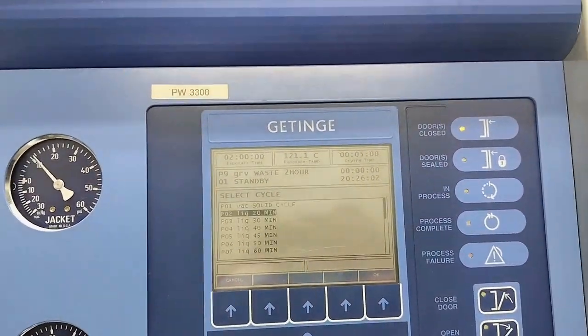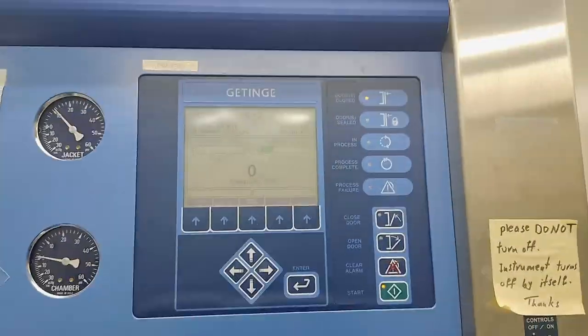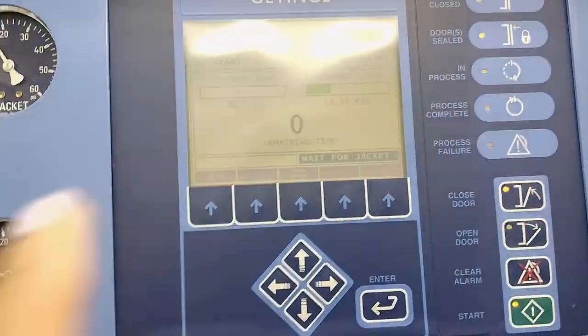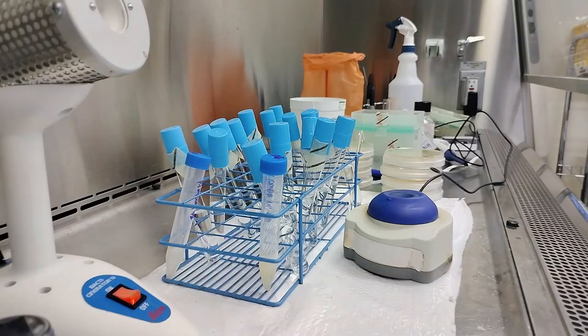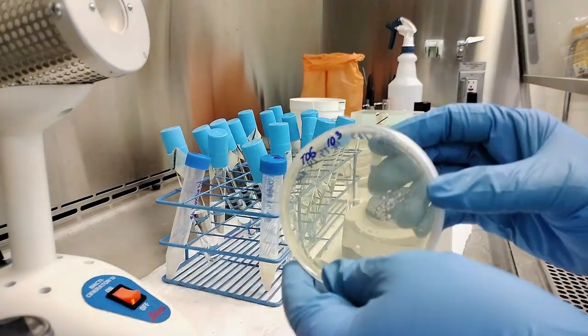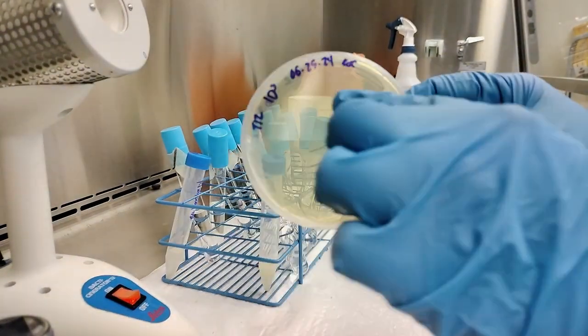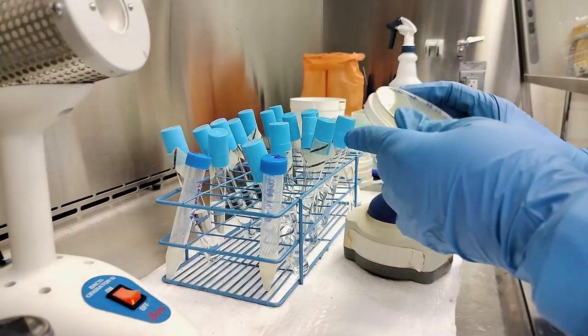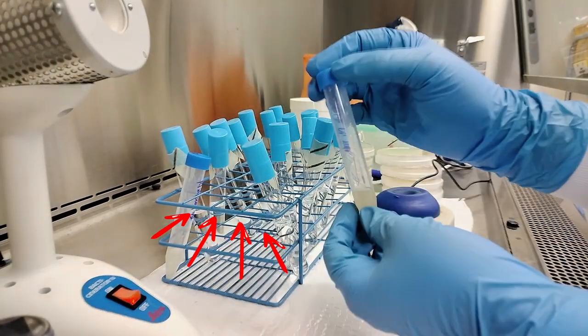Time to go to the autoclave. The sterilization cycle takes about an hour, ten minutes. Once it's done, I will remove the test tube wrap, put it into the sterile biosafety cabinet where I'll work. And I have already labeled the base of the petri dishes that I'm using.